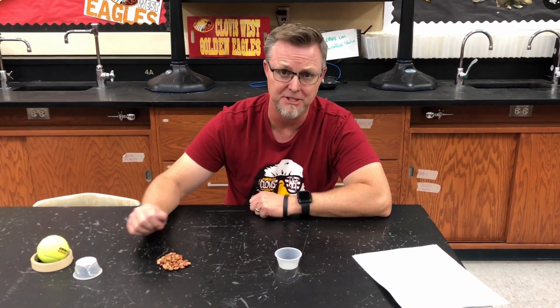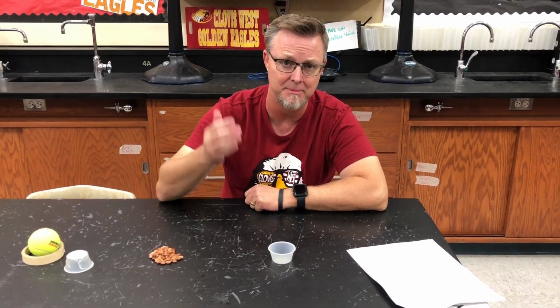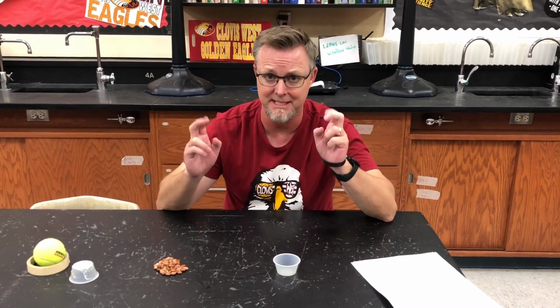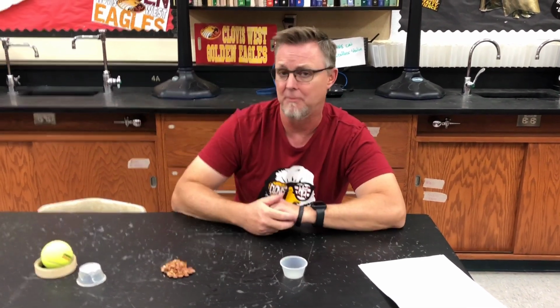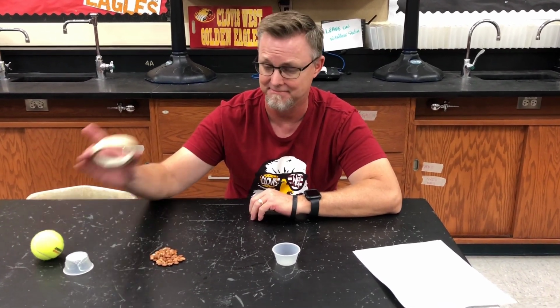All right, gang, it's time for our second experiment. Take all the information from experiment number 1, make sure it's in your data table, you added all those numbers up, and you have an average. Second experiment is called denaturization. When we denature an enzyme, we change its shape so it no longer works. How am I going to do that?